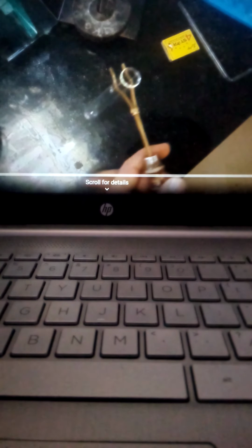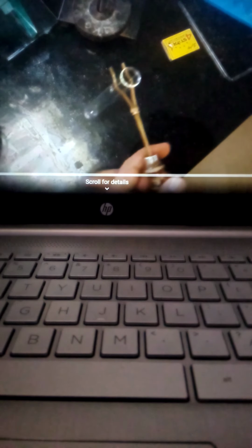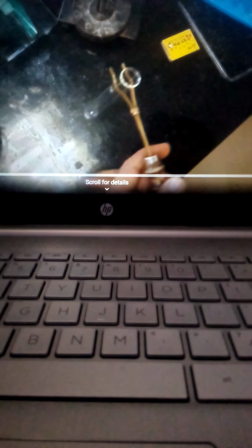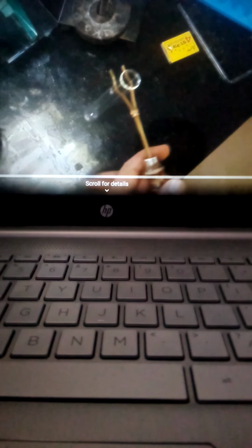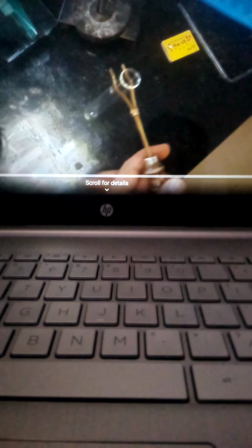In the previous session, we learned group detection of basic radicals by using specific group reagent. I hope the concept is clear to all. So today in this session, we will discuss analysis of basic radicals. Okay. So first we will discuss analysis of first group basic radicals. So let us perform the experiment.